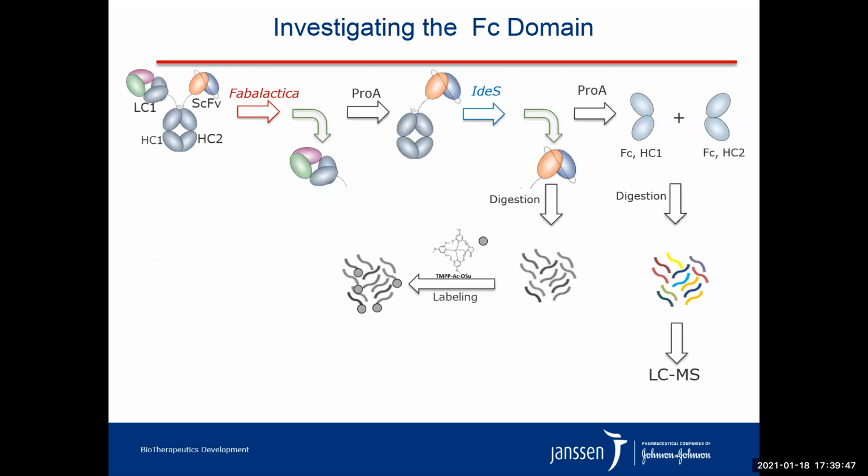To test this hypothesis, we performed the following tandem enzyme digestion experiment. Each having a protein A purification enrichment step that allows us to isolate each domain separately for peptide mapping. Trypsin and other endoprotease digestions were performed to generate peptides for each domain. Additional labeling was also performed using a hydrophobic tag known as TMPP to ensure the retention of small hydrophilic linker peptides found in the scFv linkers.